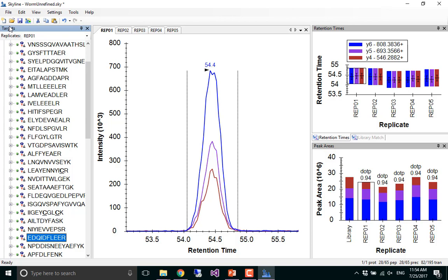and look at a study where we looked at a rat heart failure study, where we had some rats in one group and some rats in another group, and we've done all of this. You've now done all these refinement steps. We had done those too, and we were like, okay, the next step is to take our refined list and decide which ones show some difference, are useful. And we'll go through that. And with that, I release you for lunch, and we'll be back here at 1 o'clock. And yeah, lots more to play with.